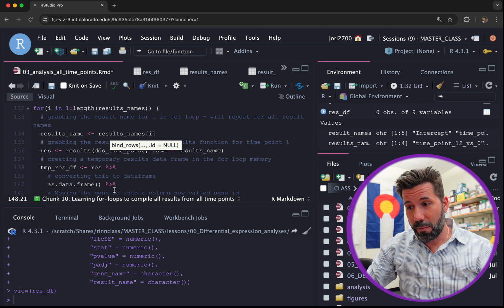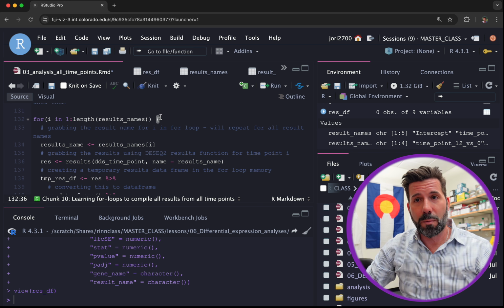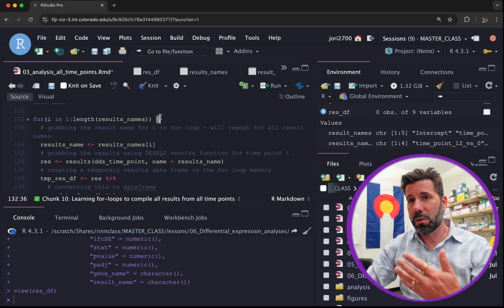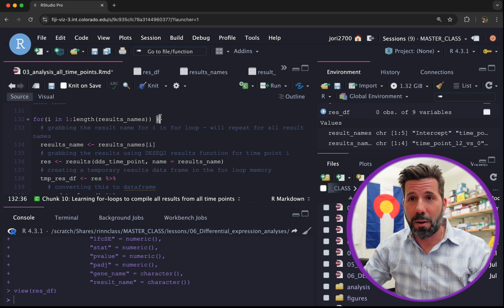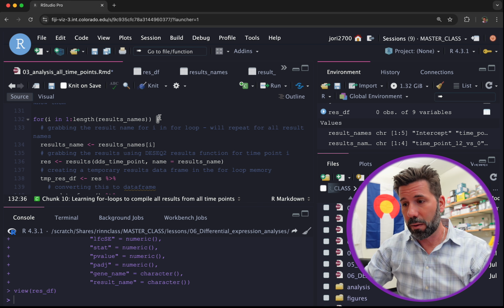And that's it. That will do it for 1 sample, 100 samples. So you can just use this if you want. I challenge you to try and use sapply or lapply to do the same thing. It would work. And a little more for loop.